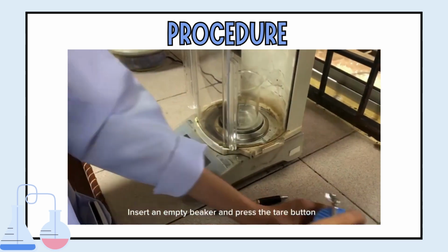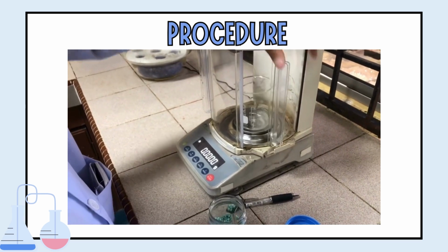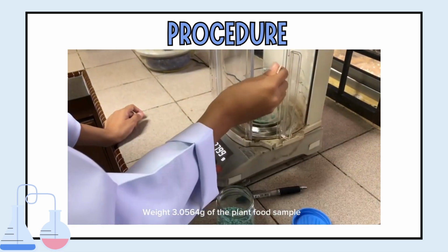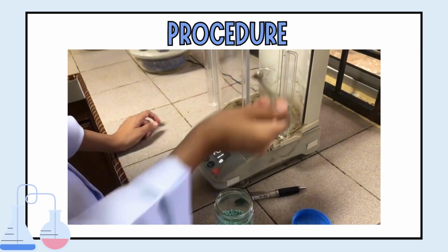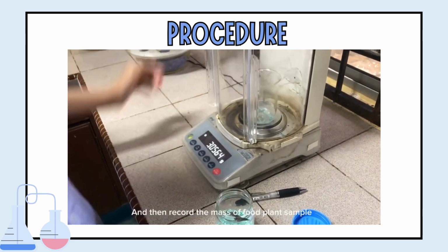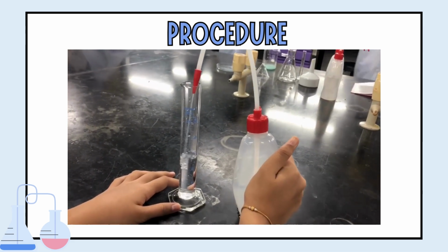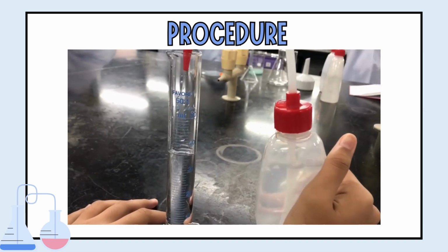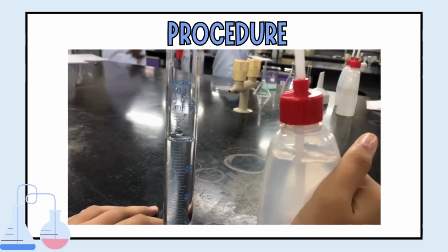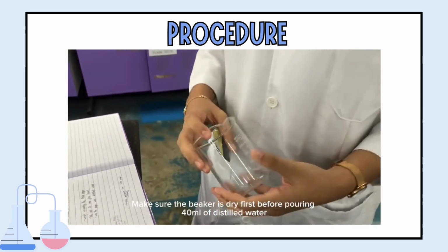Insert an empty beaker and press the tare button. Weigh 3.0564 grams of the plant food sample, and then record the mass of the plant food sample. Measure 40 ml of distilled water. Make sure the beaker is dry first before pouring the 40 ml of distilled water into the beaker.